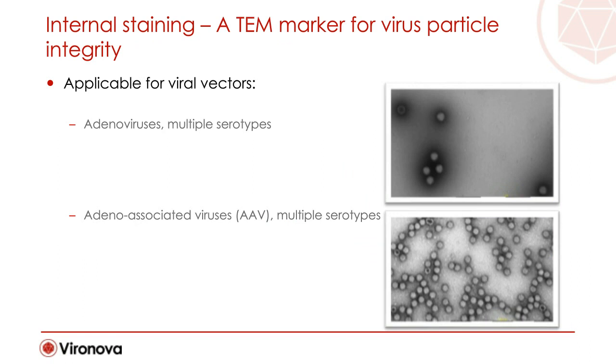So another application of usage that Josefina presented previously is the possibility to assess particle integrity throughout the production process. Biologic materials are delicate and all process steps involve shear stresses to the products. I'm going to go through two situations, AAV particle integrity and adenovirus particle integrity.